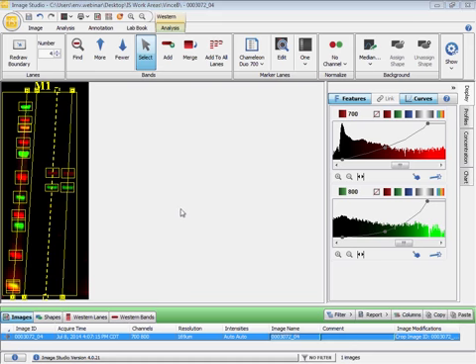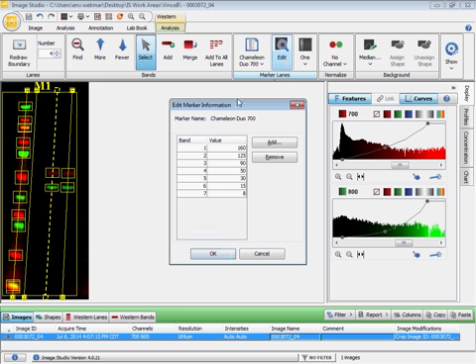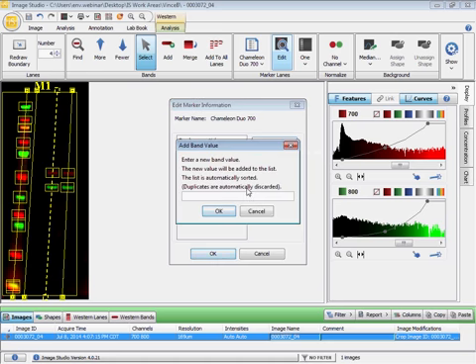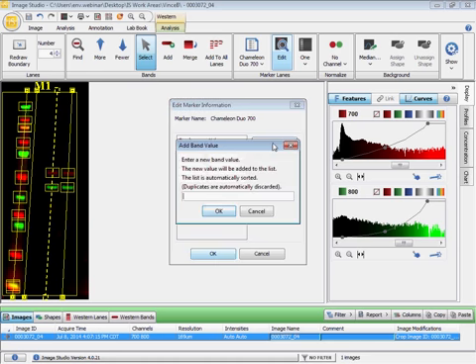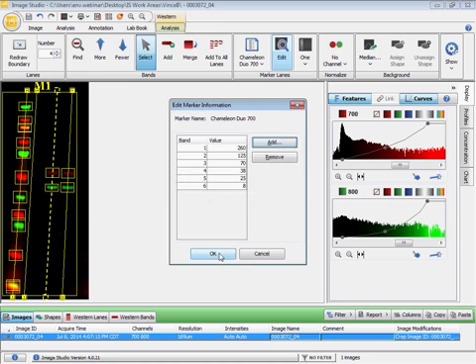Now let's repeat the process for the 800 channel bands of the Chameleon Duo ladder. So we'll click on Edit and we'll remove the band size values that are not a part of this particular marker set. And add the remaining values for the Chameleon Duo 800 ladder set. So we'll add 260, 70, 38, 25, and 8. Click OK to confirm.